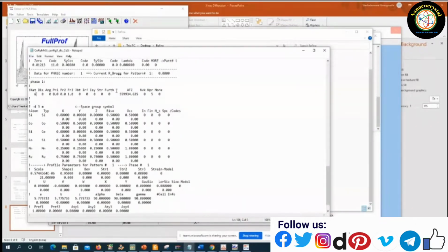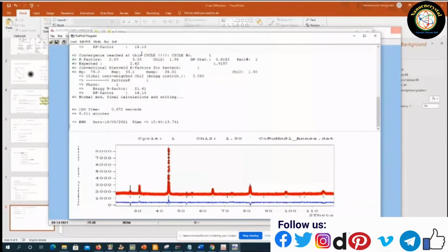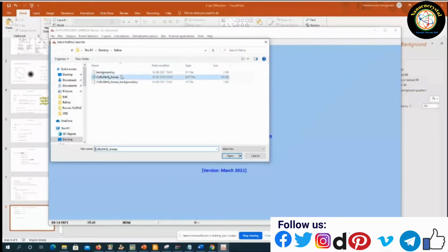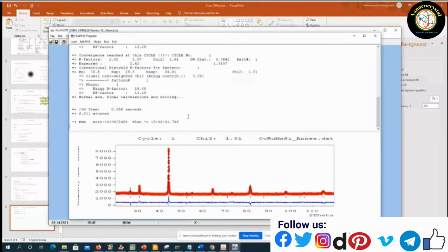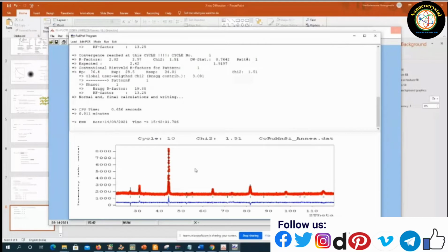So we are interested now in looking at whether there is a Co and Si disorder or not. Just close this one and run that second disorder file. So this one. Okay, now you see that this peak is slightly reduced but not as expected. So in a similar way you can actually try different possibilities.